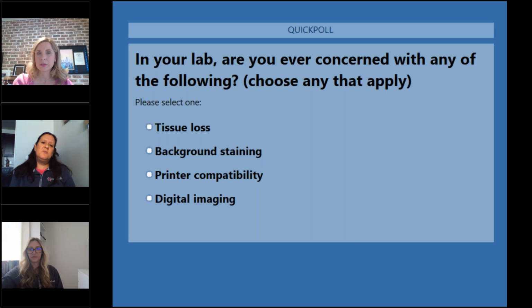Well, this was something that you never want to see in a lab. You run your IHC stains and go take them off, and you see that half of your tissue is missing. You have to go talk to your pathologist or take some time to rerun that slide so that they can see what they want. Sometimes it hasn't been dried long enough. If it's a piece of breast, maybe your lab has a specific drying protocol that's a longer amount of time. Perhaps you used a slide that you don't normally use, or maybe you accidentally put it on a non-adhesion slide. There could be lots of different reasons why you might see this tissue wash or folding. So it's just extra time that you have to go back and troubleshoot what's going on.